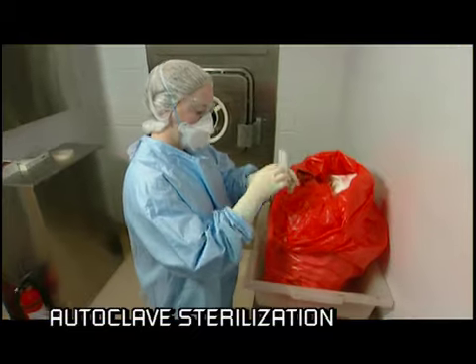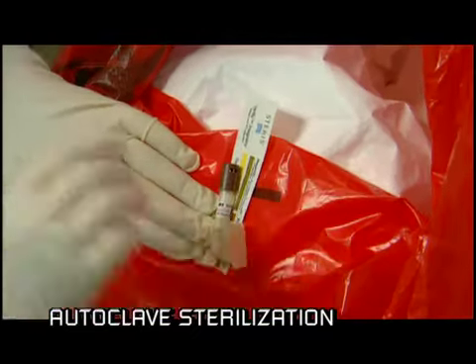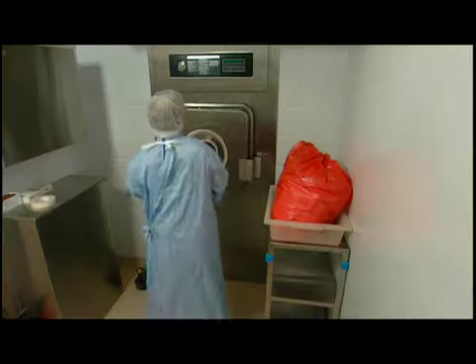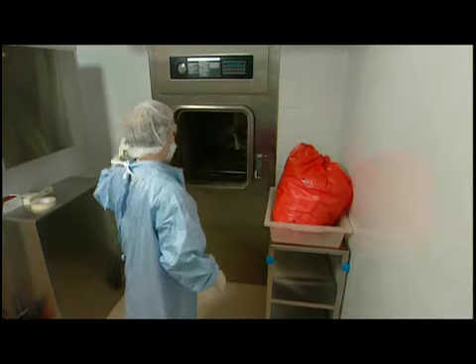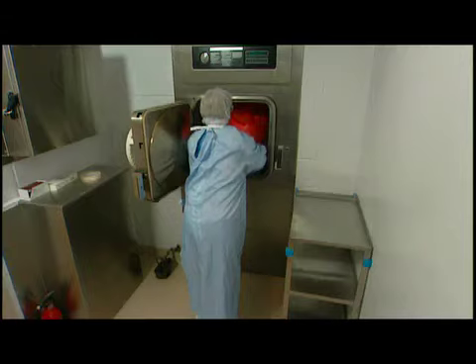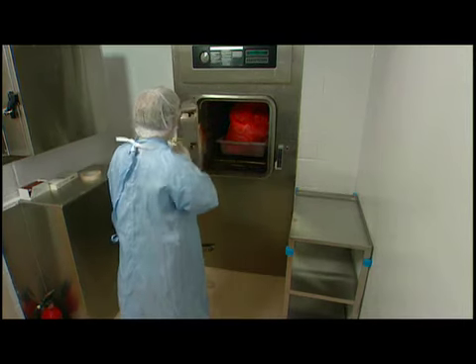Most infectious laboratory waste is decontaminated using the autoclave. As always, an interlock system prevents both doors from being opened at the same time. You should always use biological indicators to monitor the sterilization process.